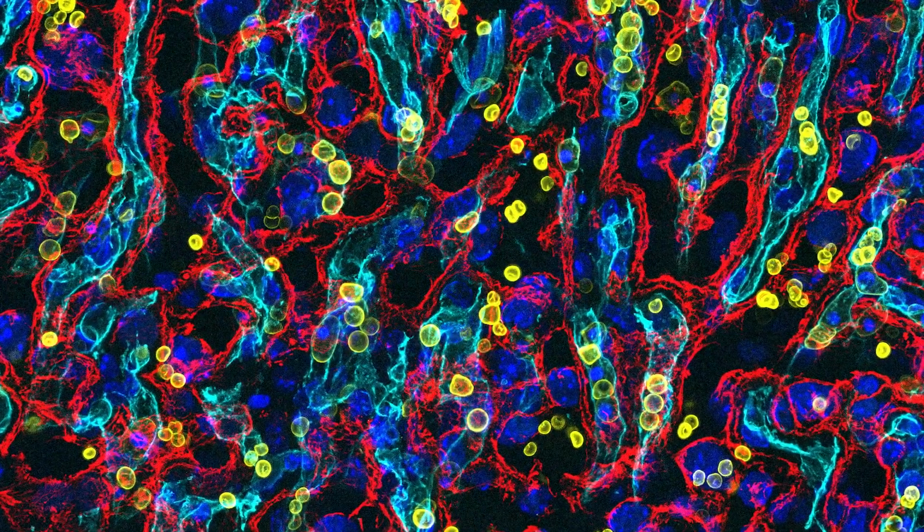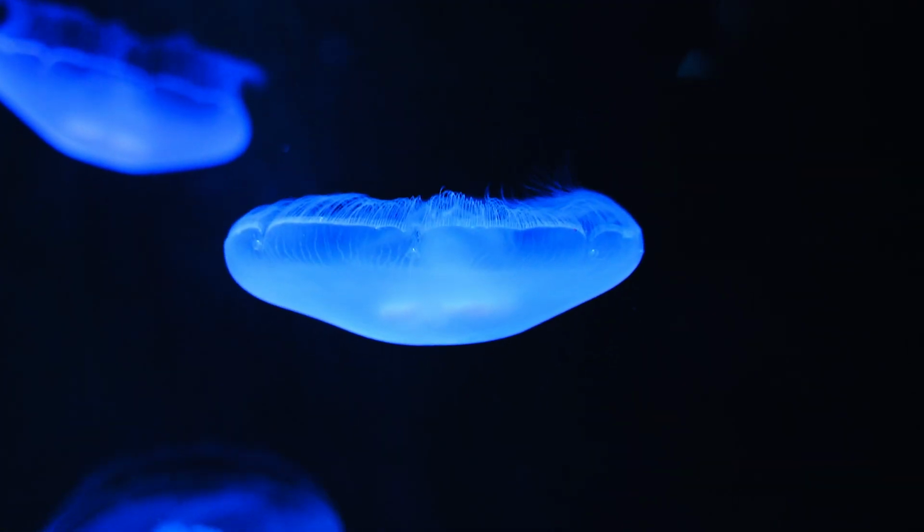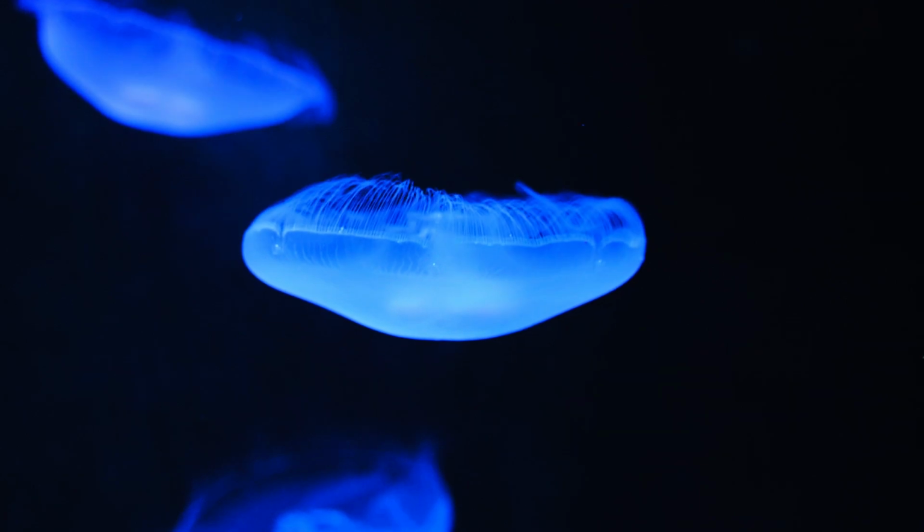Well, like most of our ingenious ideas, we stole this one from nature. There are many organisms or animals that can make themselves glow, like glowing jellyfish in the deep sea or fireflies on land. And this glow is called fluorescence. What's happening is the animal is able to absorb energy of one form and then use that in a material within their bodies to emit light of a specific color. And now we can make materials within cells and tissues under a microscope do the same thing.